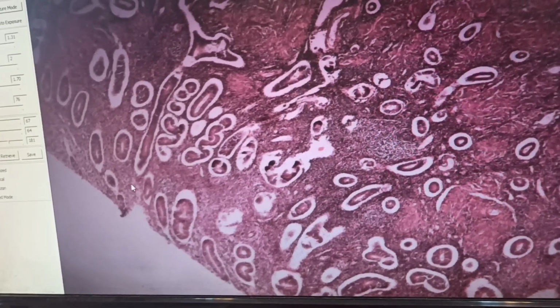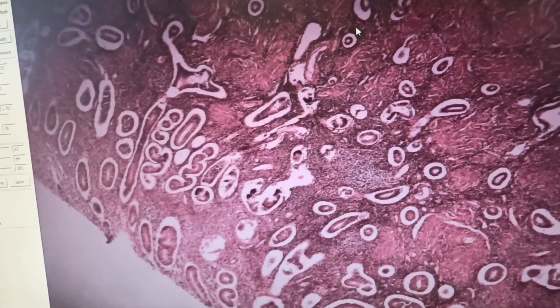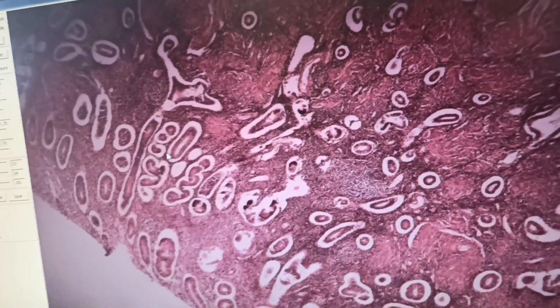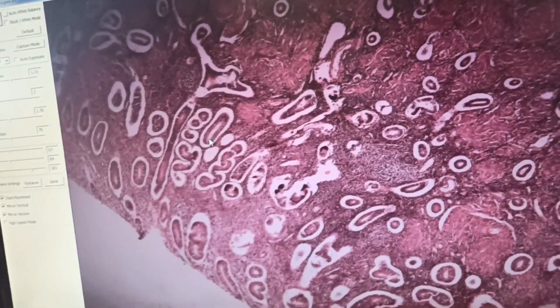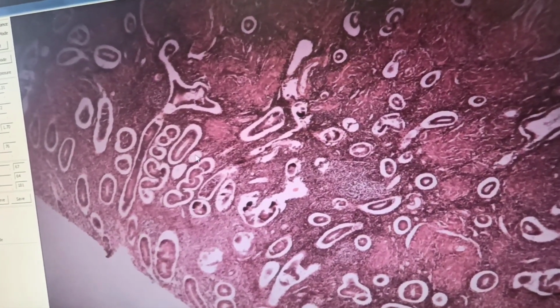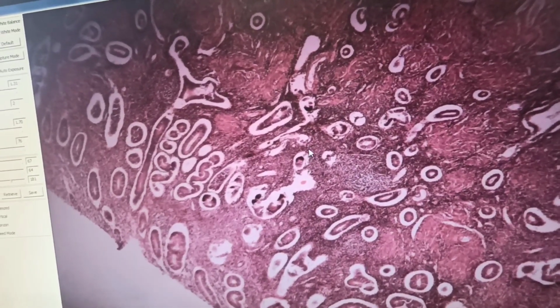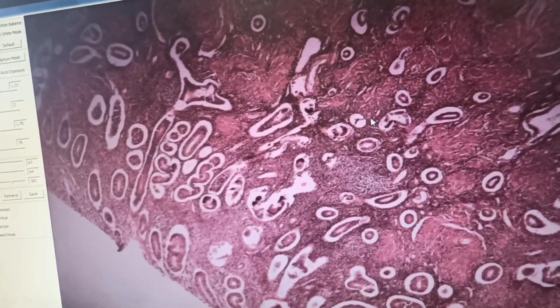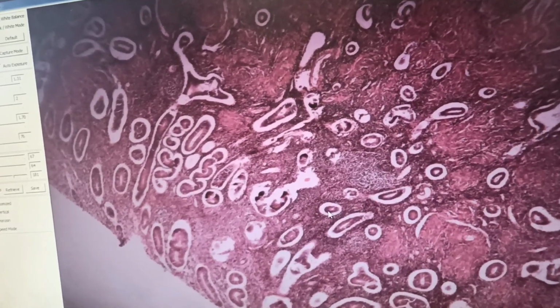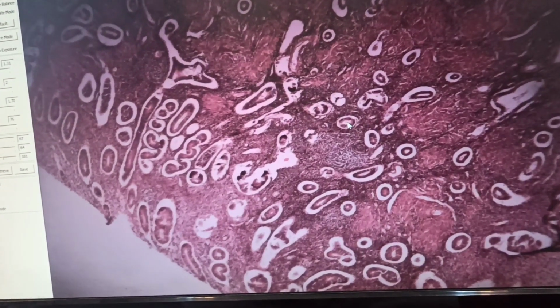The lumen, then we have the endometrium. How can we recognize the endometrium? With this gland, a section from the gland, simple columnar epithelium within the gland. It is highly stained because we have many cells in this area, in the connective tissue of the endometrium around the gland.